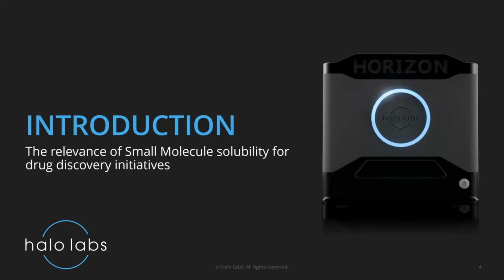So a little bit about me. I am a biophysicist by training, and I have been engaged in several drug discovery efforts. And drug discovery is not trivial, it's a big endeavor, and solubility is always a present problem at many stages through the drug discovery process.